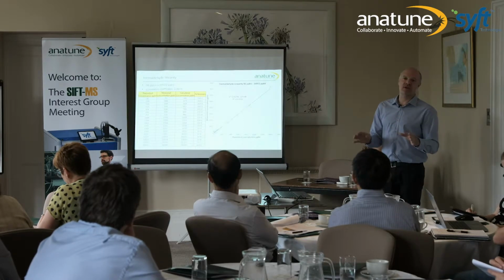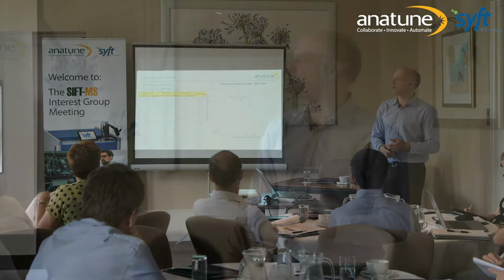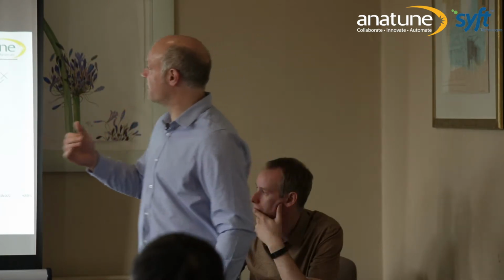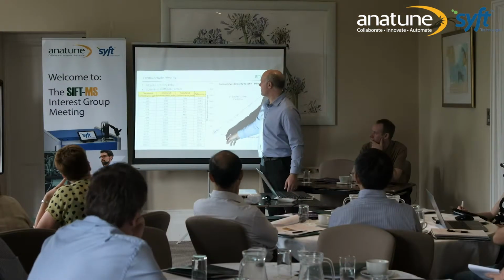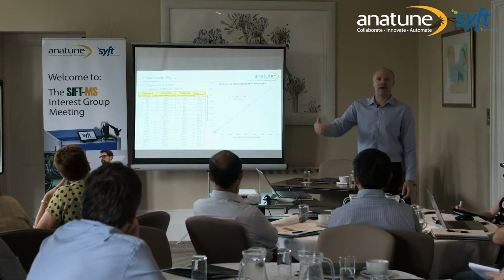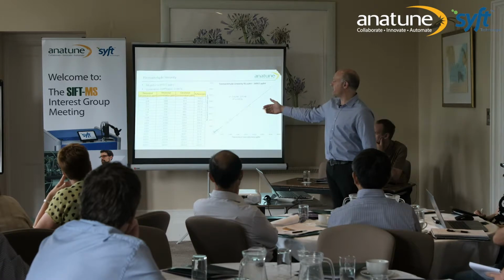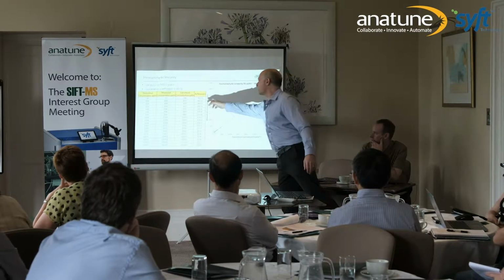The expected concentration in their devices when they were looking to analyse was somewhere between 2 and 5 ppmV formaldehyde. So this clearly covers the range of expected concentrations. The other thing you can see on this table is that we've got the measured concentration versus the theoretical concentration, and then here the concentration as calculated off of that calibration curve. So if we use that calibration curve to back calculate it, what will we get? And this generates these recoveries here.